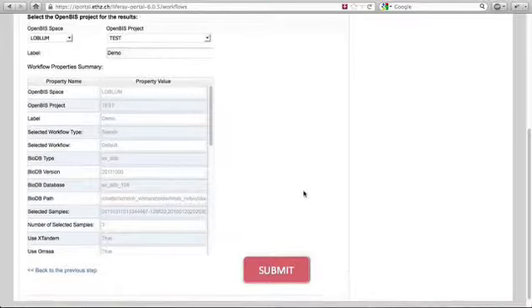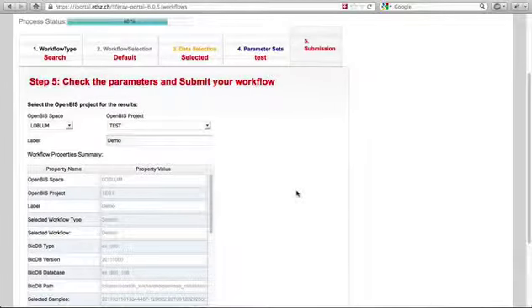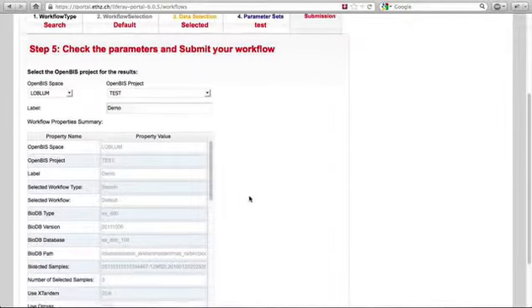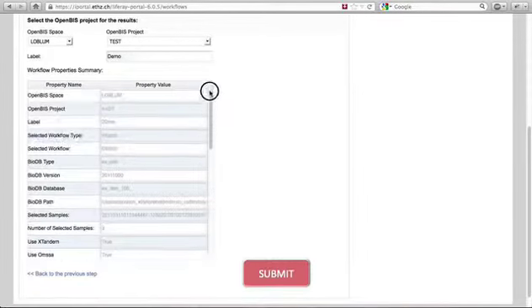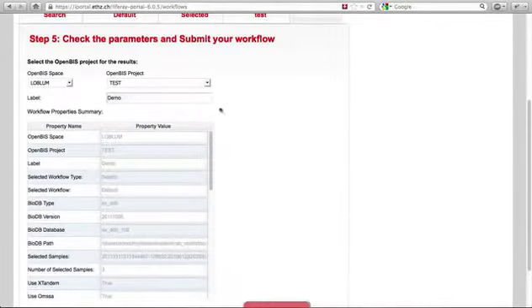As a last step of our workflow wizard, there's kind of an overview table showing all the settings that one has selected for a last time for a quick check, and one can select where to store the data finally in our system.